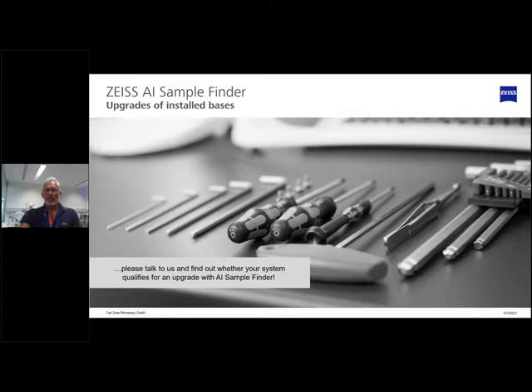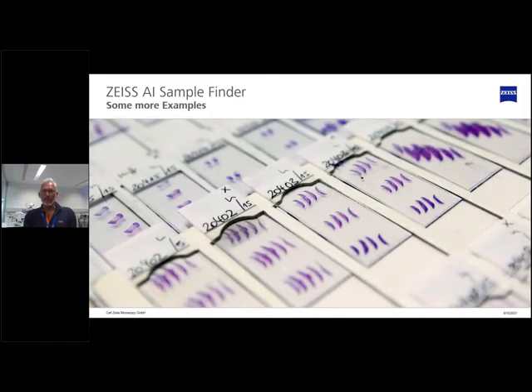A few samples before I hand over to show everything live in action. So again, some slides with some cross sections. If you look at this, I think it's no big deal to find them, but applying the tiling pattern is another story. It will take time. It's very time consuming.